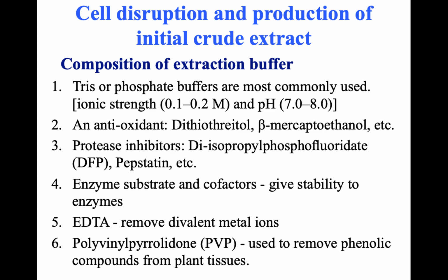At the same time, we can also use certain protease inhibitors. For example, diisopropyl phosphofluoridate, which is a serine protease inhibitor. One more example is pepstatin, which is an aspartic protease inhibitor. By adding these protease inhibitors, we can minimize the action of the proteolytic enzymes.